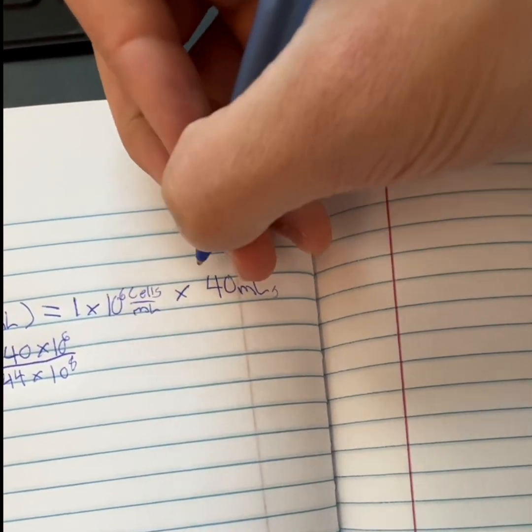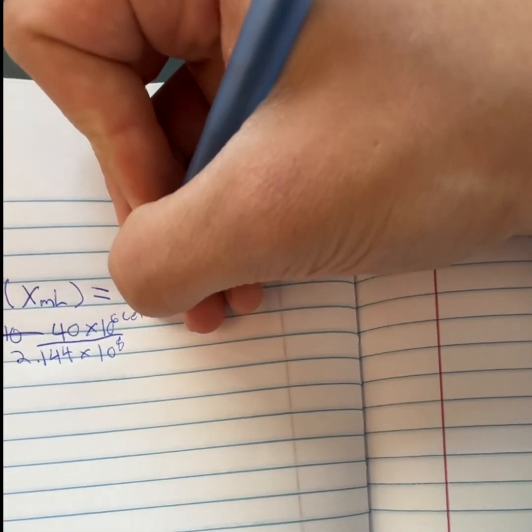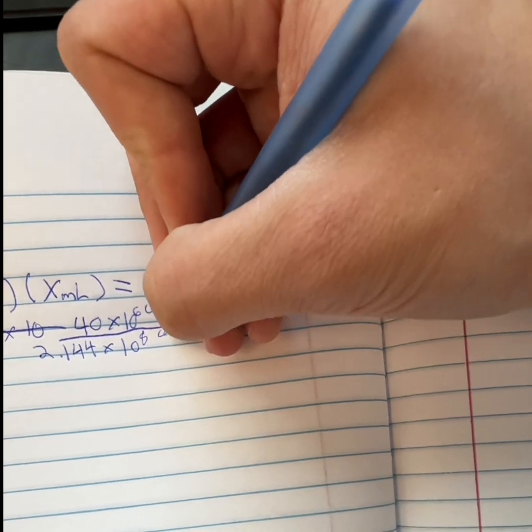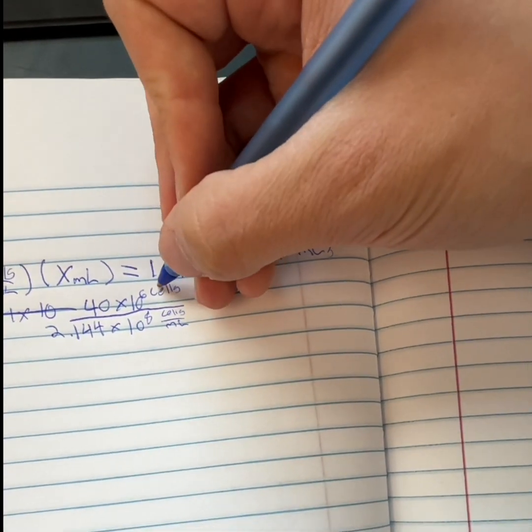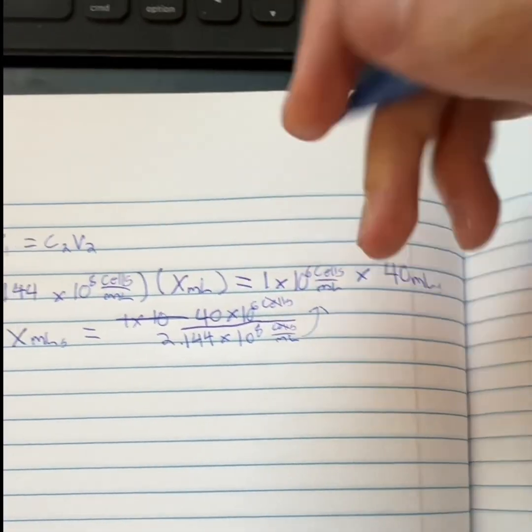If you include the units, these two are going to cancel out, so this is just cells up here. Down here it's cells over milliliters. These are going to cancel out and you're going to get milliliters on top.